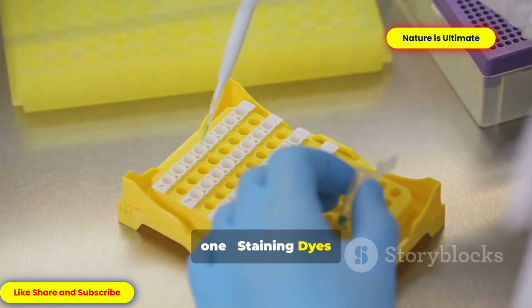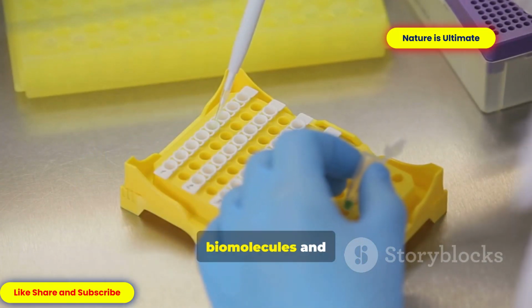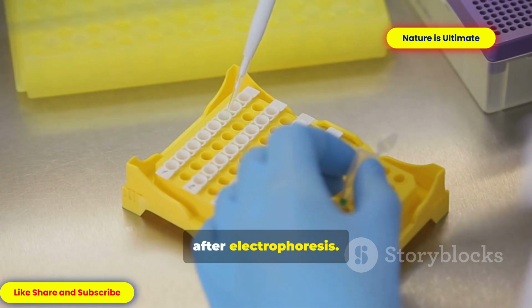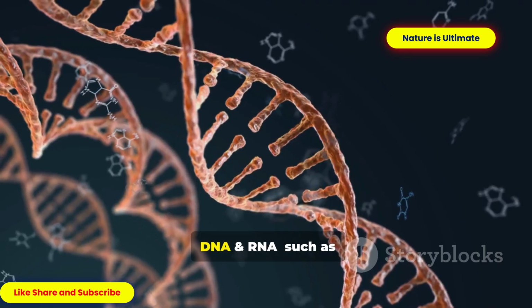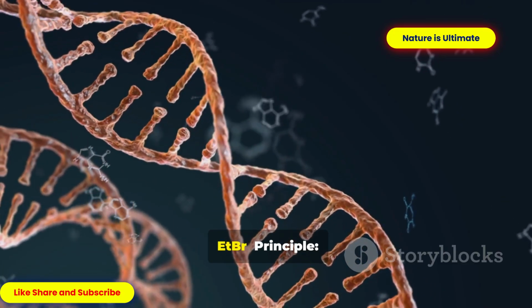1. Staining dyes in electrophoresis. Staining dyes bind specifically to biomolecules and allow visualization after electrophoresis. They are: A. For nucleic acids, DNA and RNA, such as Ethidium Bromide, EtBr.